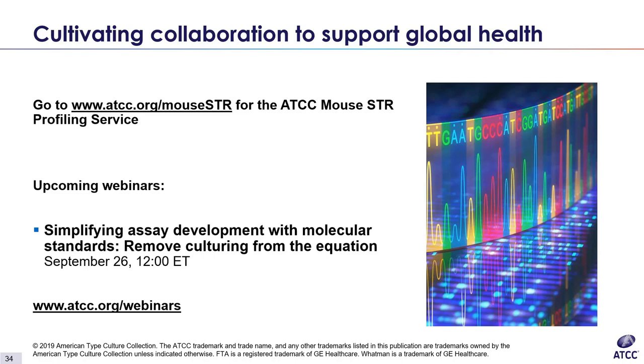All right, great, thank you, Brian. I'm gonna send the next one to Balsam. Here's a question around confidentiality. Does ATCC share my STR profiling results with anyone else?